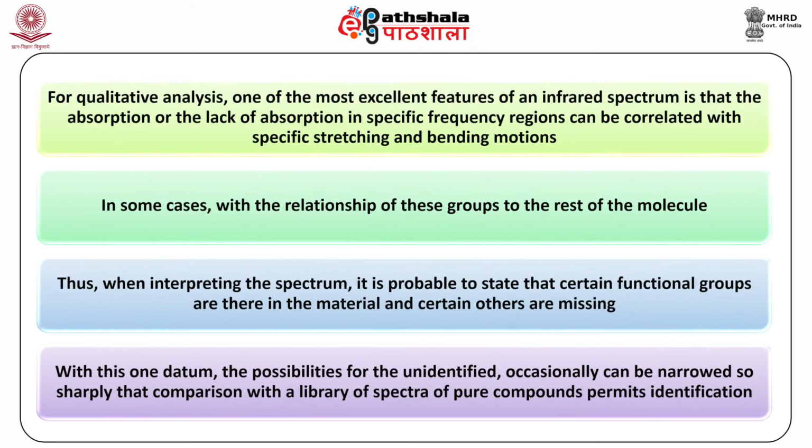For qualitative analysis, one of the most excellent features of an infrared spectrum is that the absorption or lack of absorption in specific frequency regions can be correlated with specific stretching and bending motions, and in some cases with the relationship of these groups to the rest of the molecule.